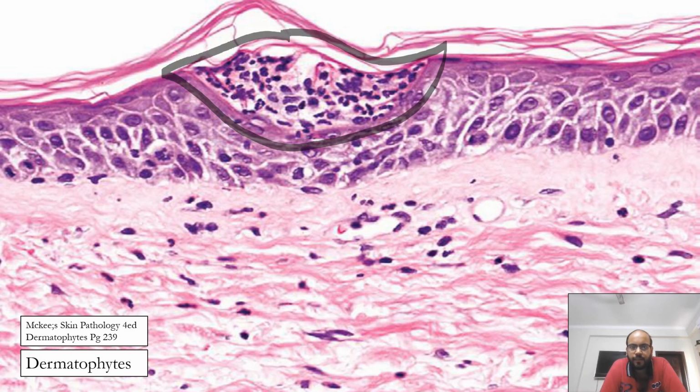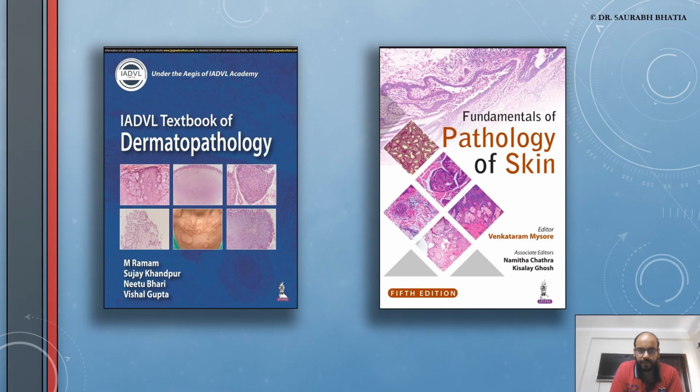Think of the most accomplished, biggest dermatopathologists that you can think of, and even they might have problems in analyzing what are the cells inside. So don't worry, especially at this magnification, it would be tough. When you're looking at a biopsy, it's much clearer, and you can go to larger magnification to be sure of your findings. But you can easily appreciate that at least there are inflammatory cells inside the spongiotic vesicles, so that you can zoom out, go into higher magnification at 40x or something, and look at those cells.